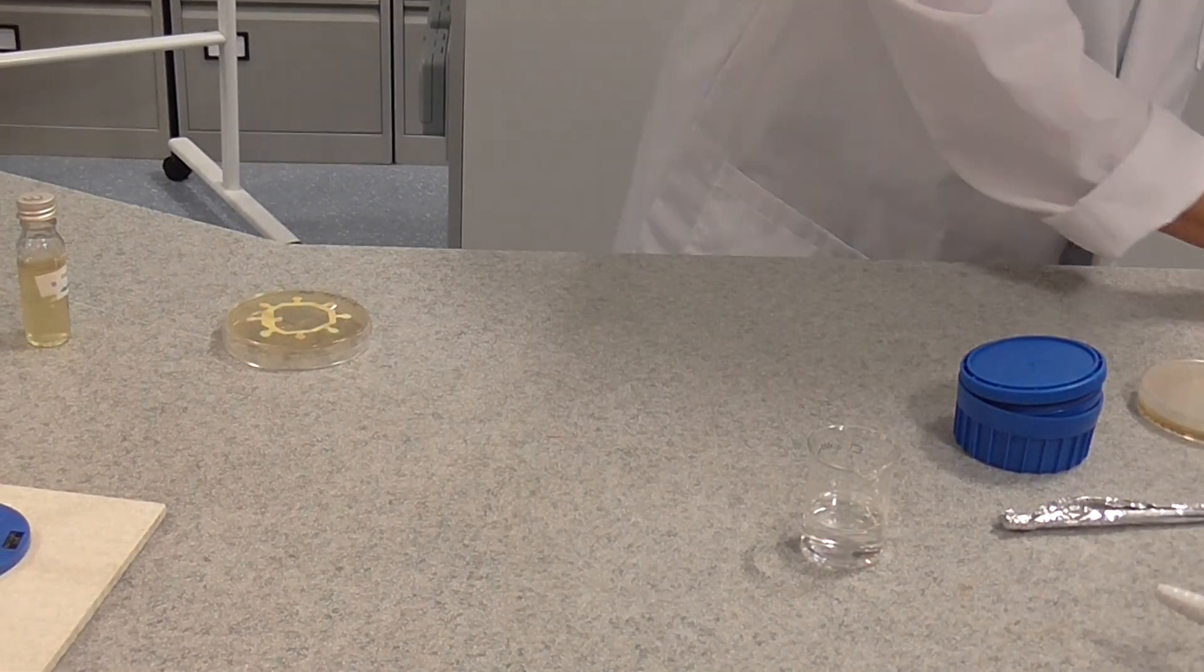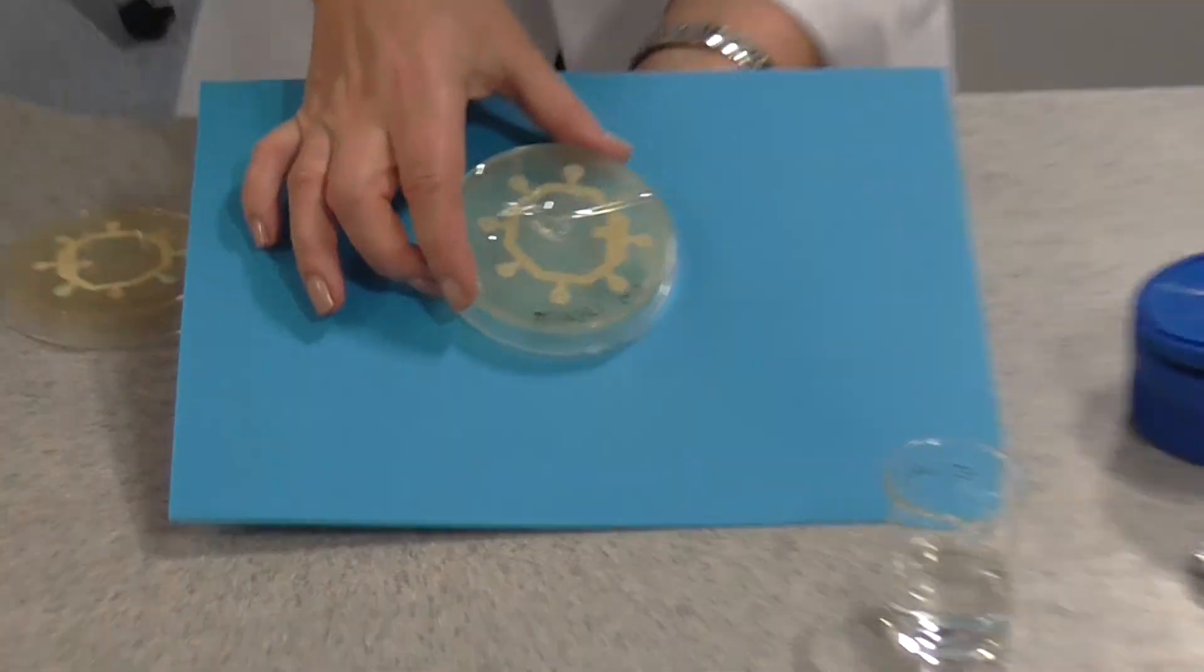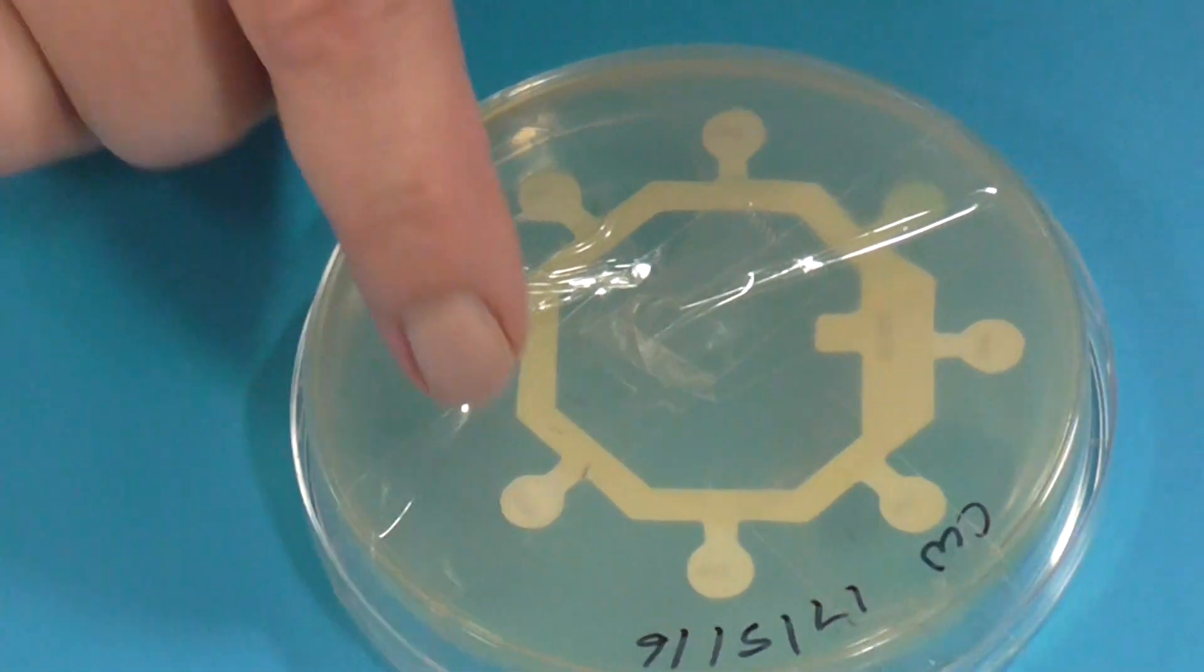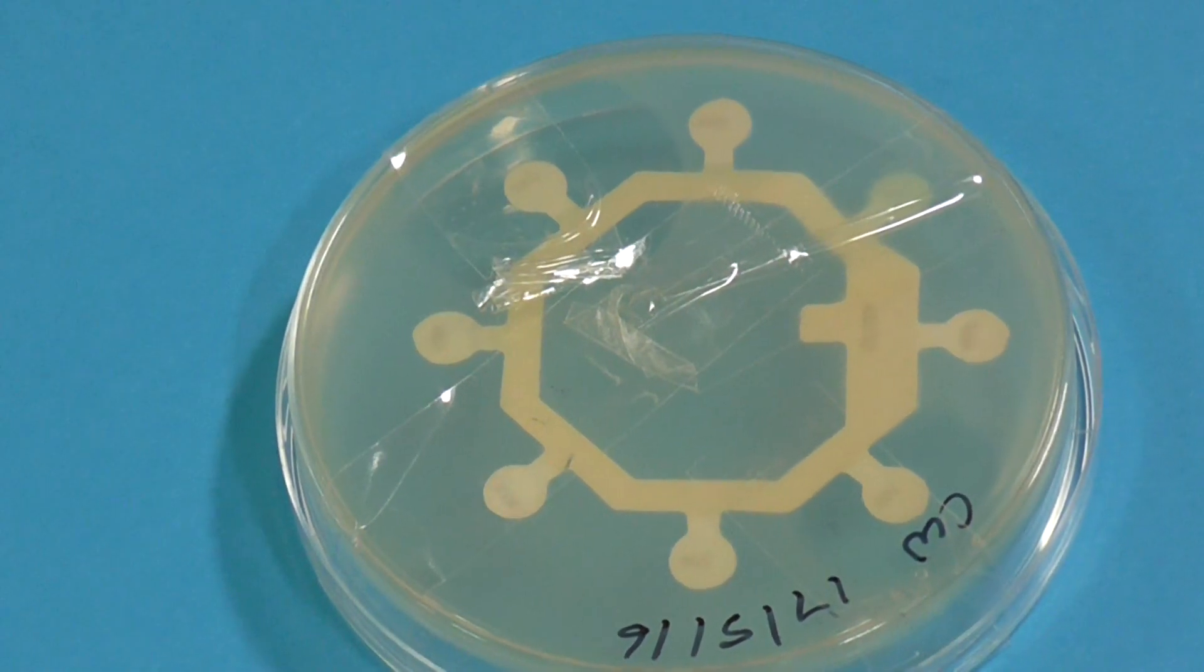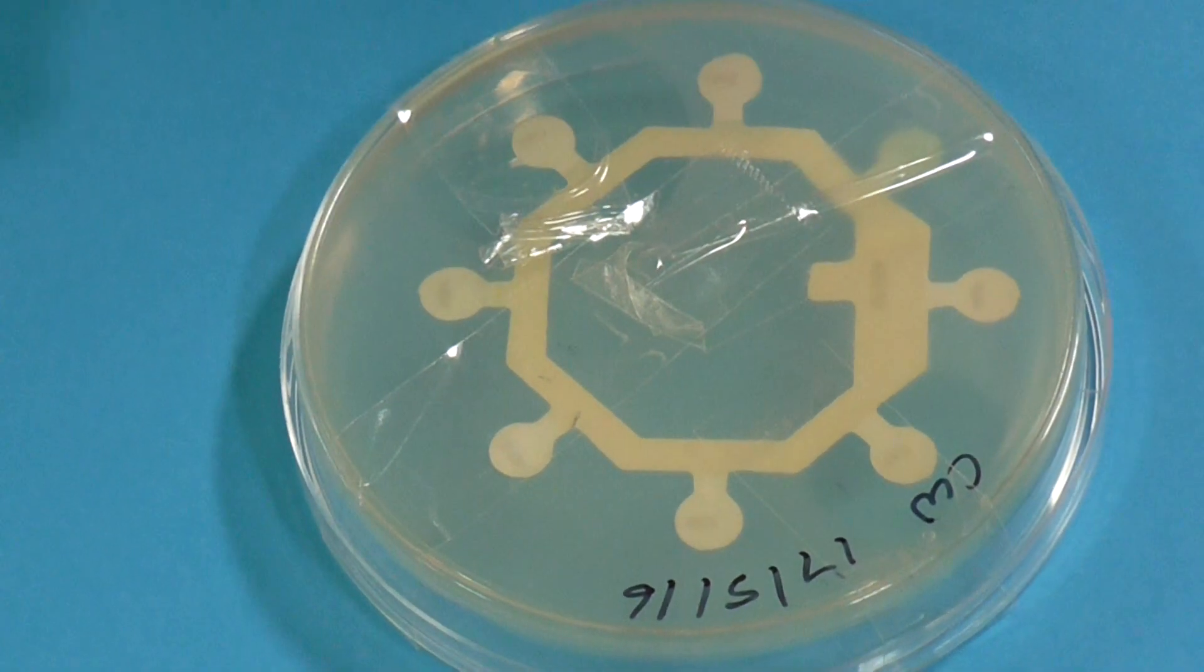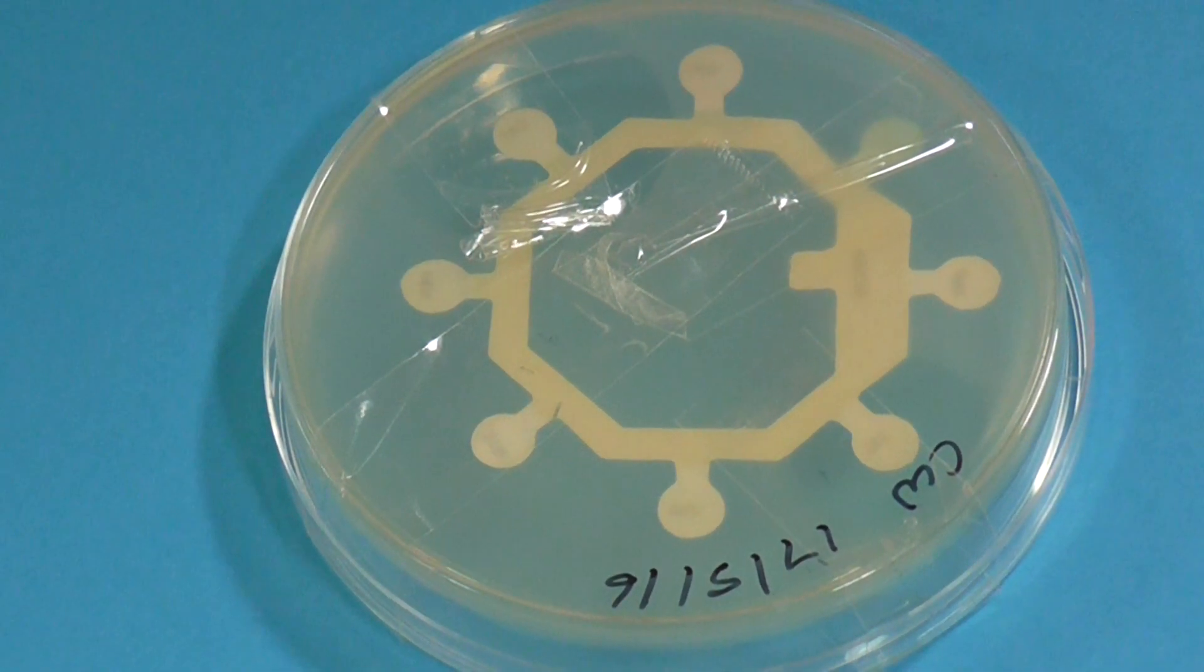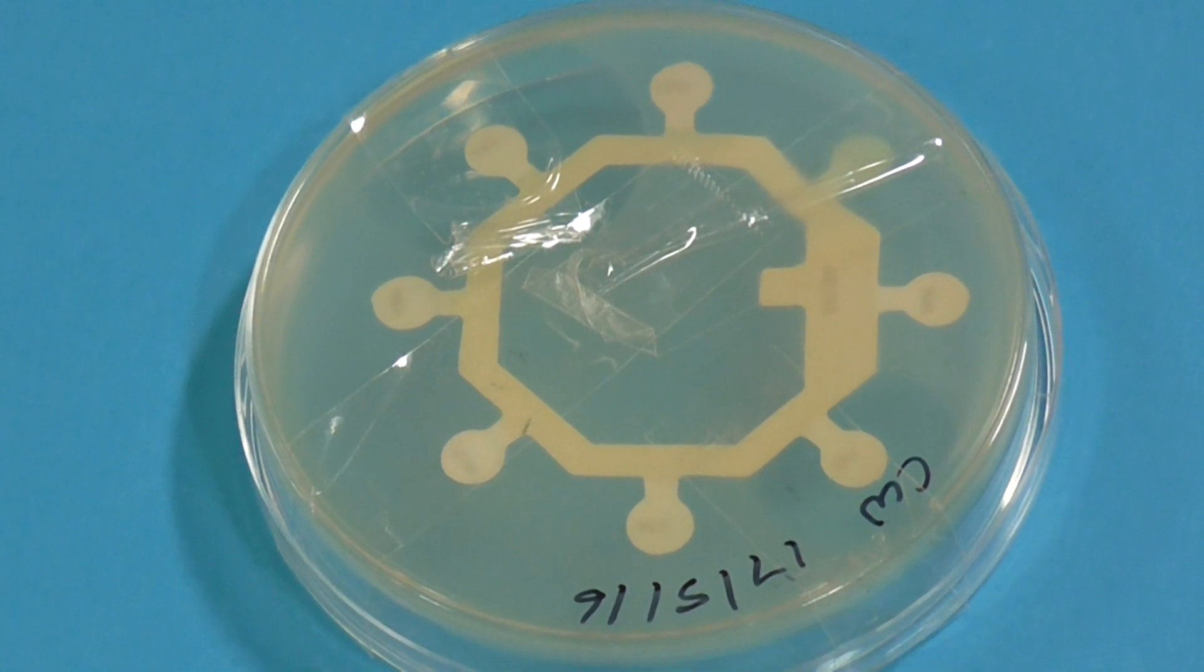Now I have got one I made earlier here. It's slightly tricky to see, but if you zoom in there, you can actually see that around some of the little discs of antibiotic, there are some zones of clearing or growth inhibition. This is where the different antibiotics have actually diffused. And remember that word diffusion is important. They've diffused into the agar jelly and they've actually prevented the growth of the bacteria there in the lawn.